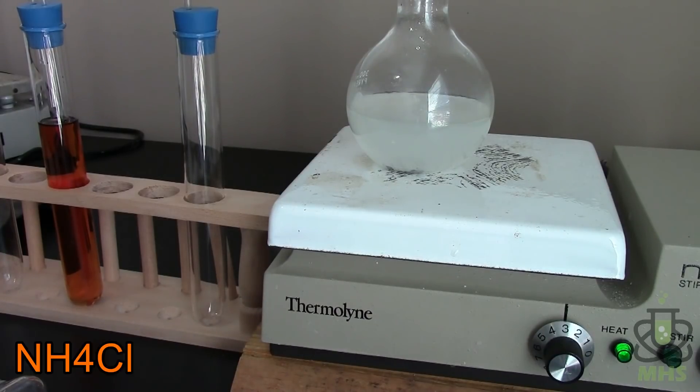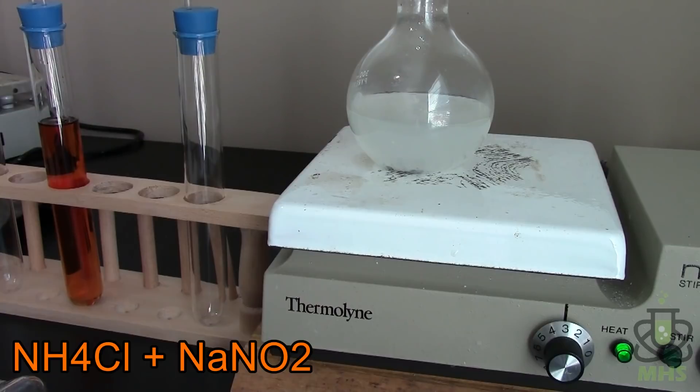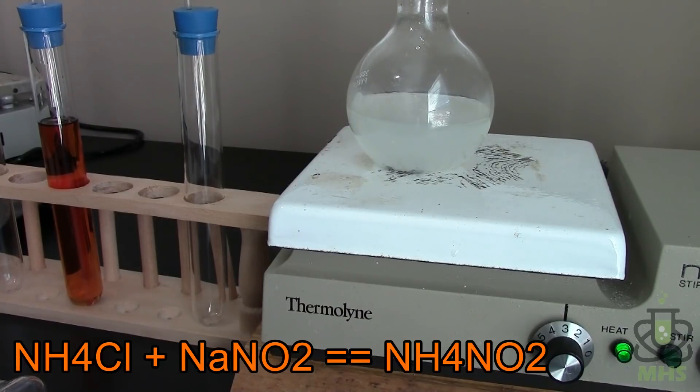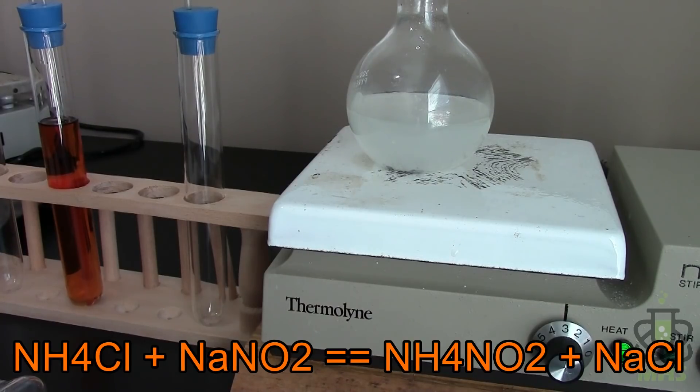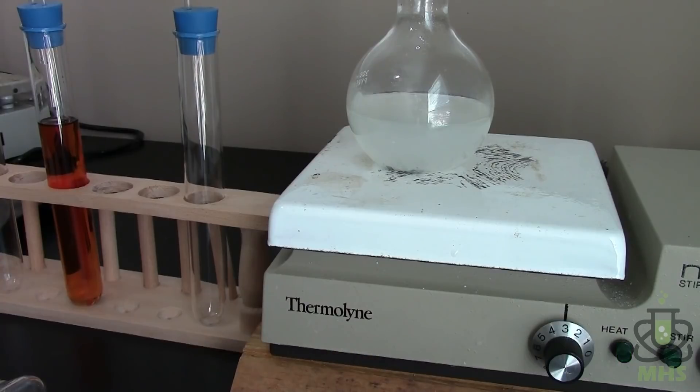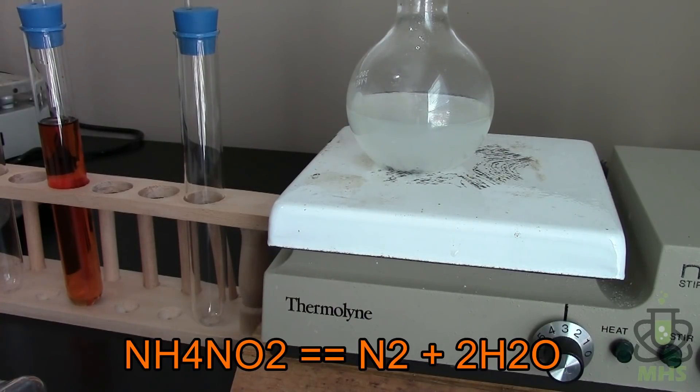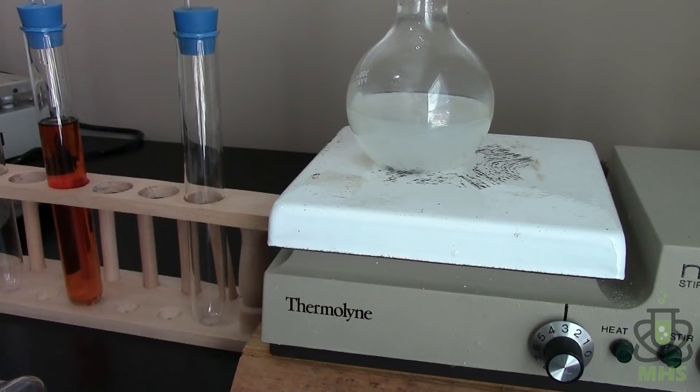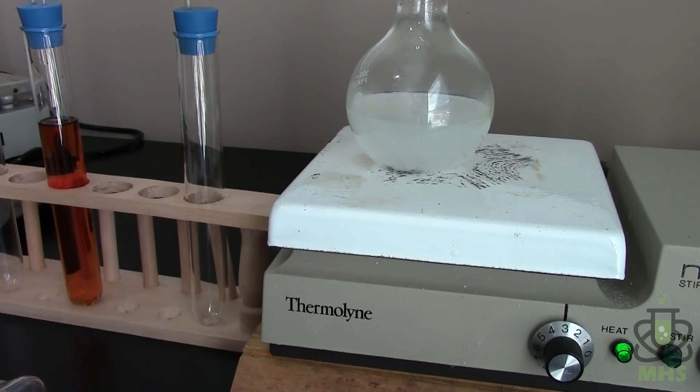We're reacting ammonium chloride and sodium nitrite and these produce nitrogen in a two-step reaction. So first step it makes ammonium nitrite and sodium chloride or table salt and then the ammonium nitrite turns out is pretty unstable especially at higher temperatures. So that will decompose and turn into nitrogen and water. And so that means the overall reaction is ammonium chloride and sodium nitrite gives us salt water and nitrogen gas. So it's a nice clean reaction.